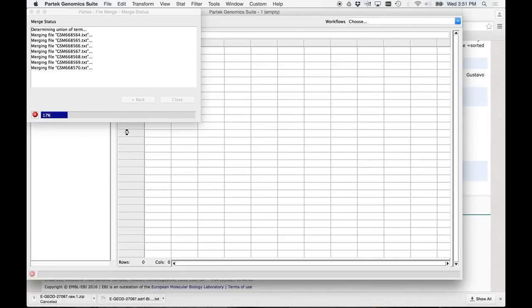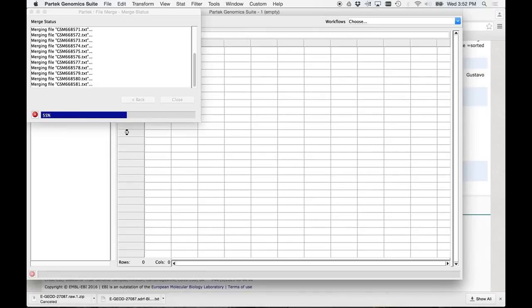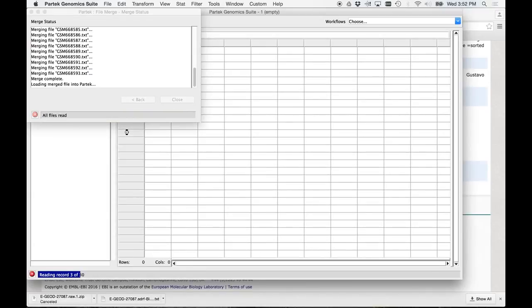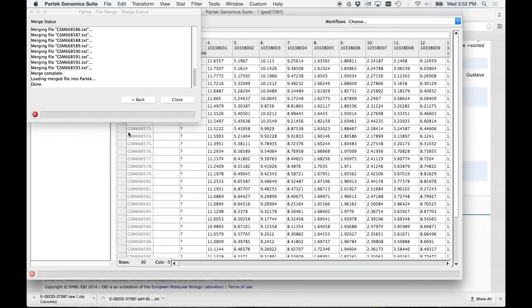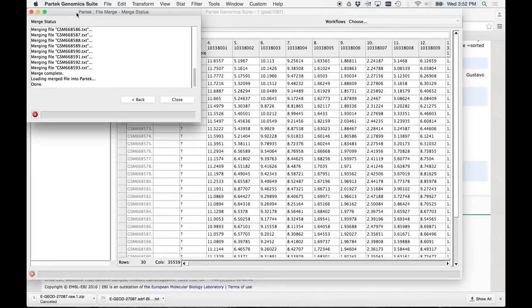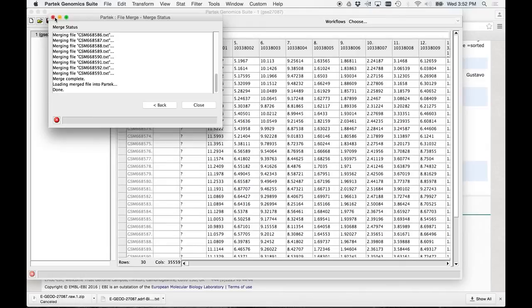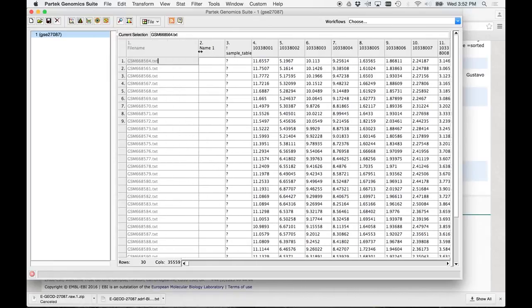Okay. Now it's basically merging them. So this shouldn't take too long. But you can see, we found a study. Oh, this is what makes bioinformatics so powerful. We found a study. We decided, what were we going to, what are we interested in? Stem cells. Not only stem cells, but embryonic versus pluripotent. We put those keywords in, search GEO. We found a study we thought was interesting. You can read all about that study. We then basically found that accession number, went to PARTEC, told it, go get that information, and with a few clicks, I don't know, what's 30 times 33,000? You know, we almost got a million bits of information in just like that. Right? Here is our file.